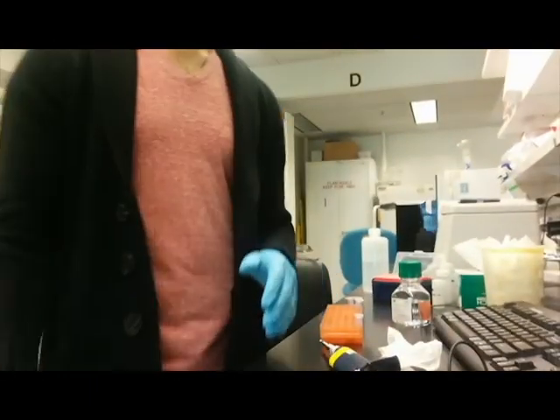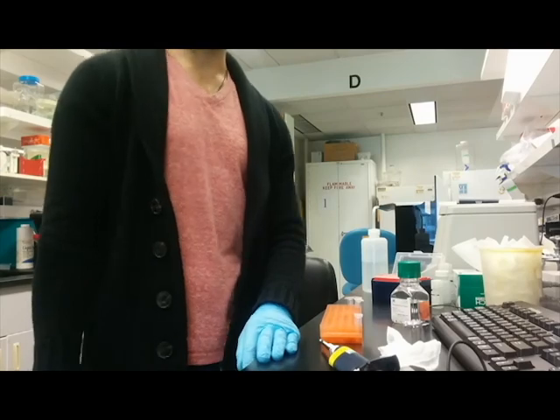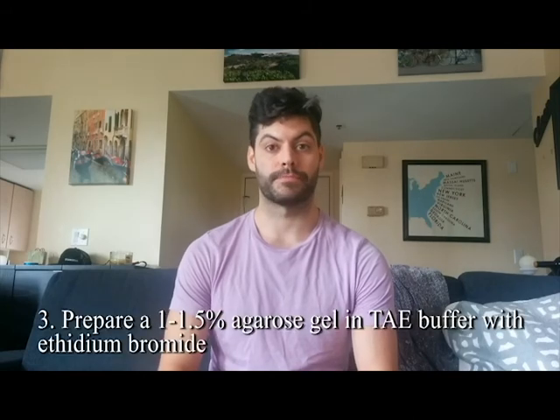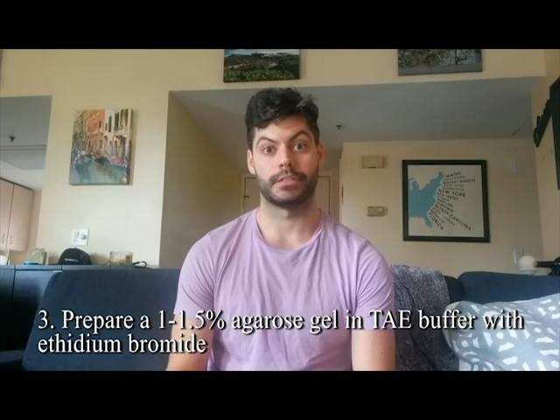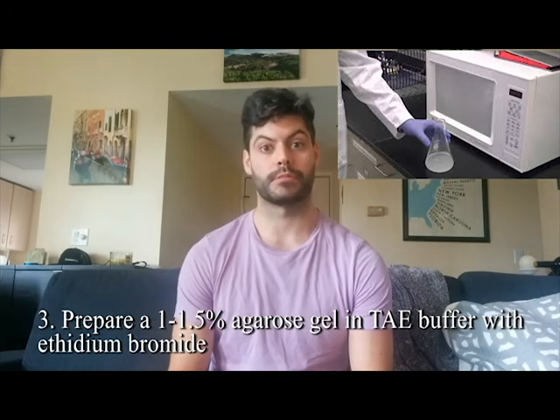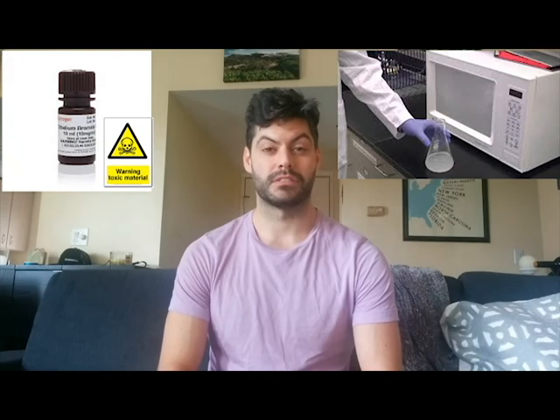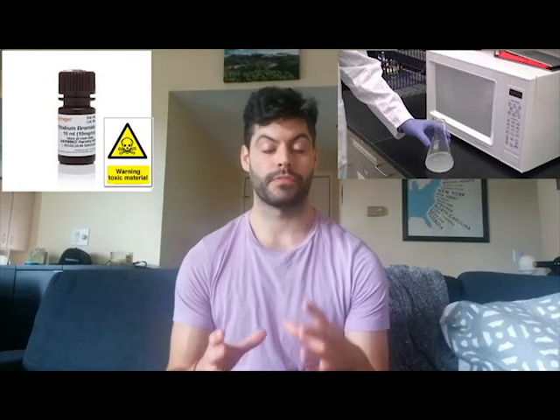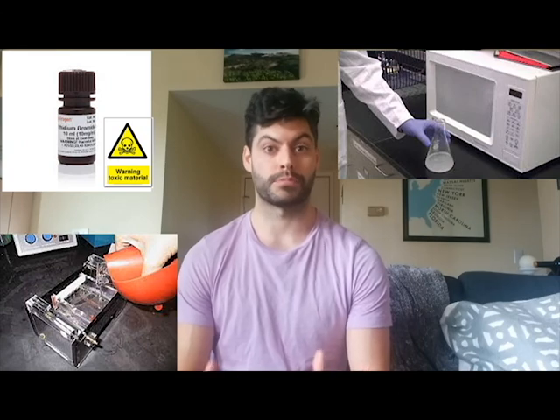To determine whether the RNA is intact — which is actually more important for QRT-PCR — we need to run a nucleic acid gel. Since every lab has different equipment, I'll just describe the process. Pour a 1–1.5% agarose gel in TAE buffer; melt the agarose in TAE using a microwave, which can take up to 3–4 minutes depending on volume. Add ethidium bromide at about 0.2–0.5 micrograms per mL into the liquid gel, swirl it, then pour it with the appropriate comb for your number of samples.